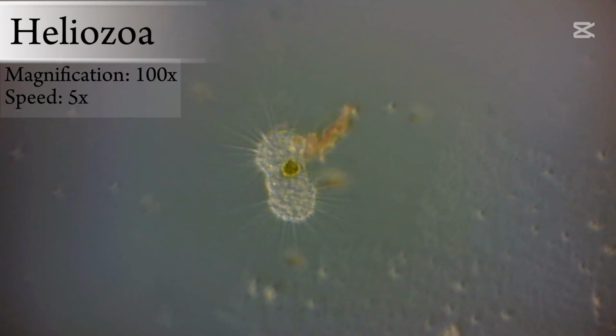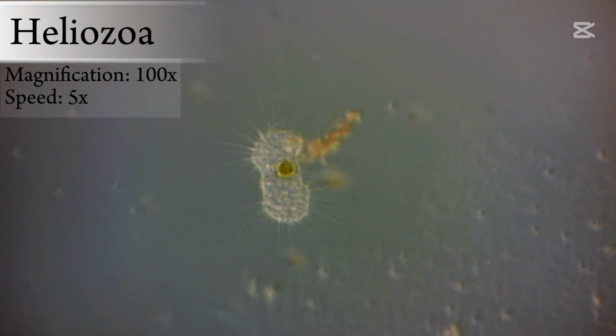I still had not recovered from such a surprise, and I noticed I was twice as lucky. Here the heliozoa is undergoing a binary fission. That means it is reproducing in an asexual way. One individual is making a copy of its genes and organs and is dividing those copies into two daughter cells, which are clones of its parental cell. As soon as I noticed this was happening, I chose to stay and record the whole process.